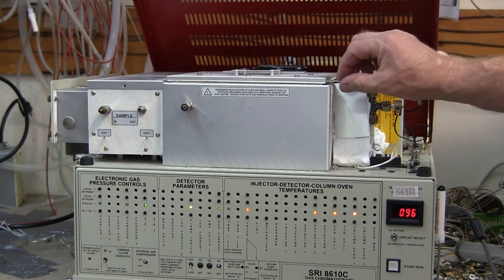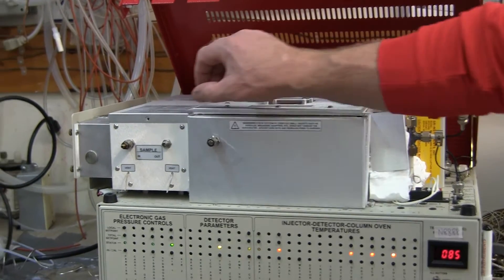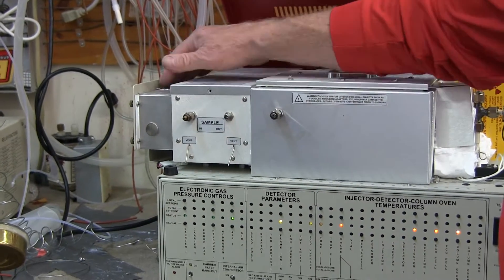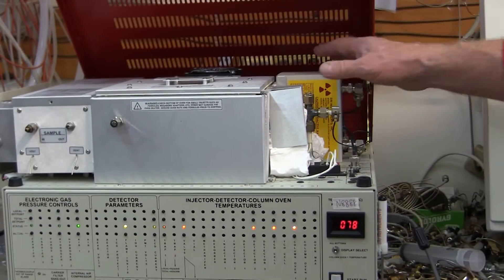The 8610C is the most common box. It has a sizable column oven, room for a valve and valve oven, a pre-concentrator if necessary, and up to six detectors mounted on the right-hand side.